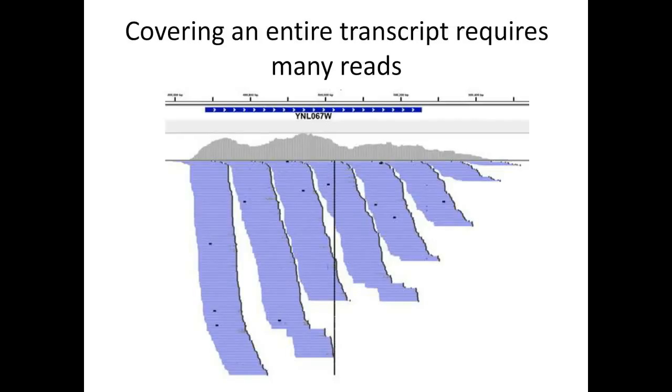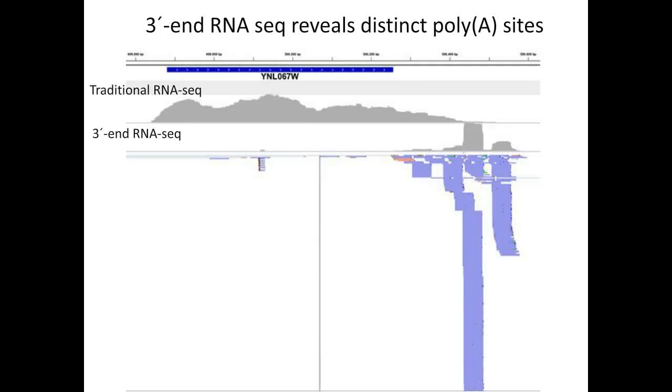Thank you, Brenda. So that's a good question. If we look back at the full-length transcript sequencing, we can see that a large number of reads are required to map the transcripts. And so with a genome that's not well characterized, the full-length transcript sequencing can be important to first identify where the genes are. But with genomes that have been previously mapped, the 3' end sequencing provides a superior approach for quantifying gene expression and for mapping the precise ends of the transcript.